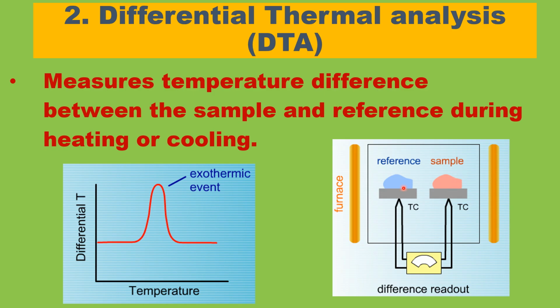As you see, the temperature difference dT between sample and reference increases because of the exothermic process. Here there is no reaction, so there is no change in temperature.